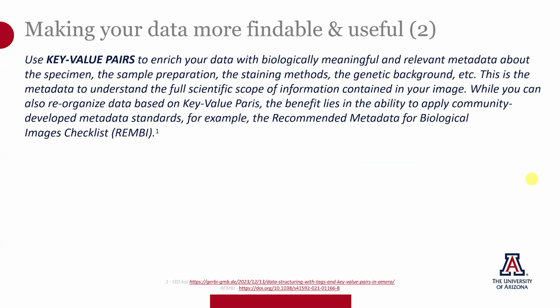Key value pairs are where you would categorize important information about the experiment, like the type of specimen, the sample preparation techniques, staining methods, genetic background, and all these different things that will help you understand the full scientific scope of the information contained in your image.